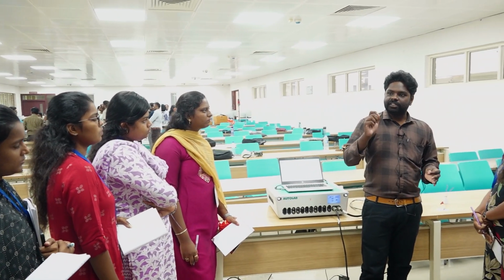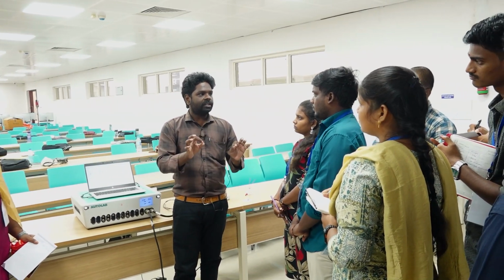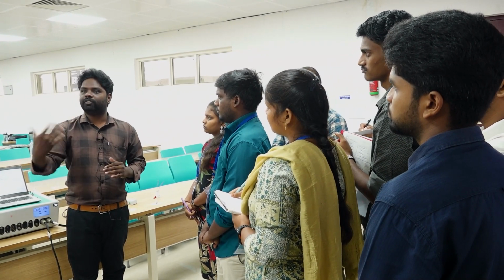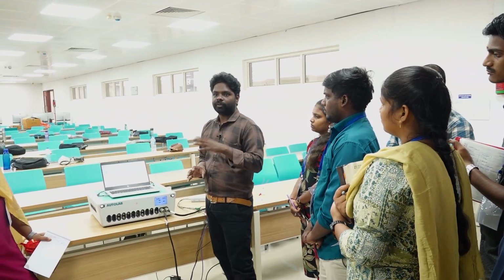So this is an important technique. This is a non-destructive method. Generally, corrosion people first do the EIS, because once they polarize, your material will be disturbed. So without disturbing the material, EIS is one of the best techniques to analyze the properties of our sample.